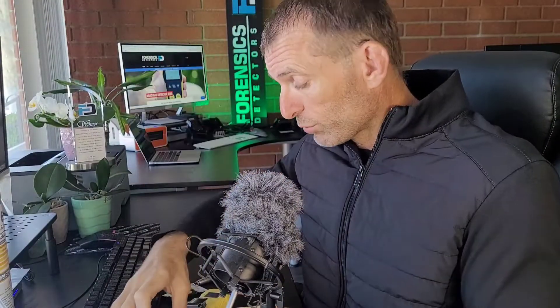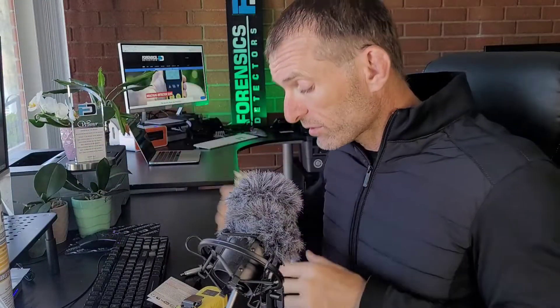The detector comes in a corrugated, strong cardboard box. It comes with the detector, a color manual, a calibration certificate — signed by our technician in Los Angeles and dated so you know when it was calibrated. We typically calibrate it the same day you order and ship it the next day. It also comes with a calibration cap, USB recharge cable, and a carrying sling.